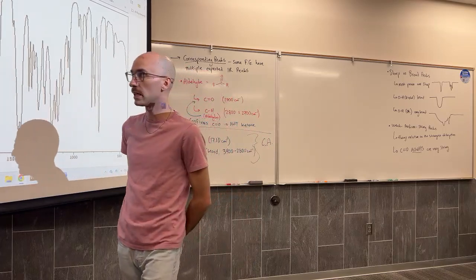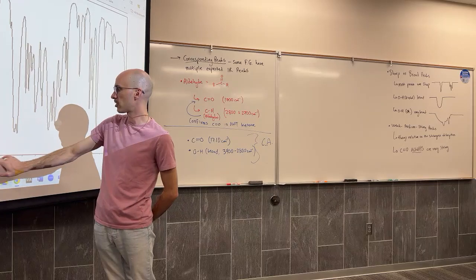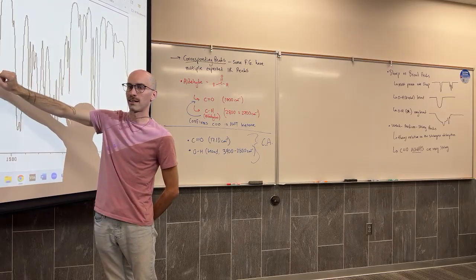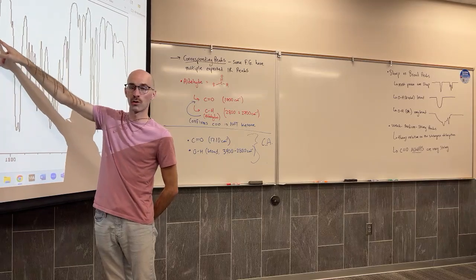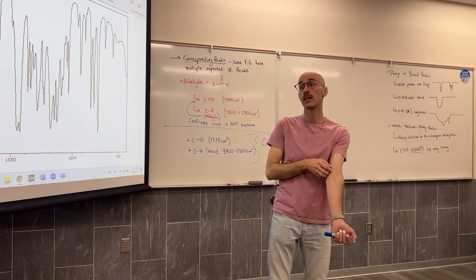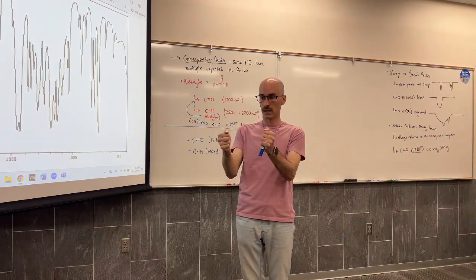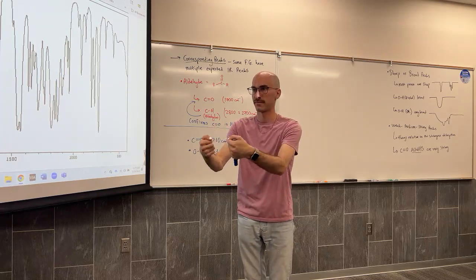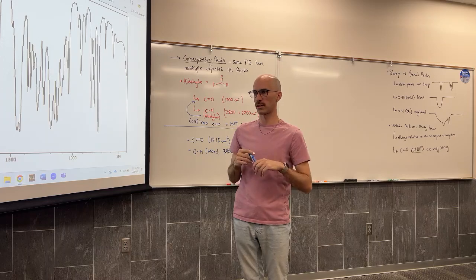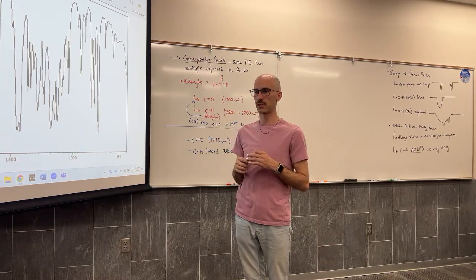And if there's the amine, if this is the NH stretching, I should be able to see the NH bending somewhere in here. Either it's overlapped with your aromatic ring or this isn't an aromatic ring. What do you mean, bending versus stretching? The NH absorbs in two different ways. The NH bond absorbs by stretching. The NH bond also absorbs by bending. It absorbs at different frequencies according to the correlation table. You'll see NH in two places. Once at the top, once closer to the fingerprint.